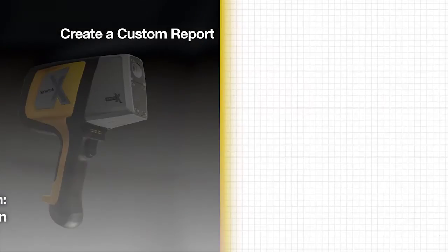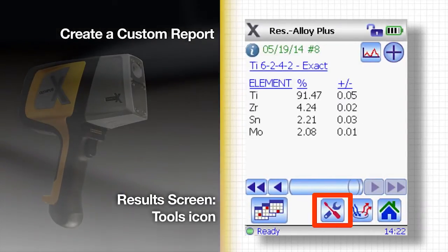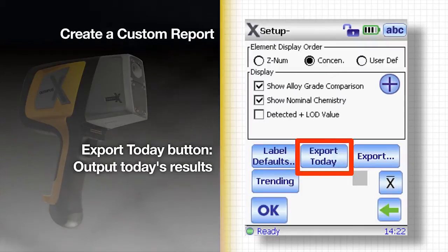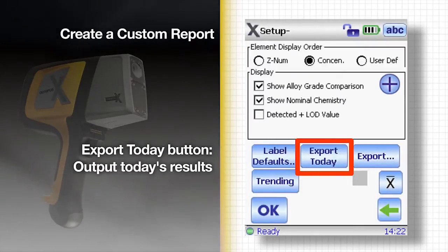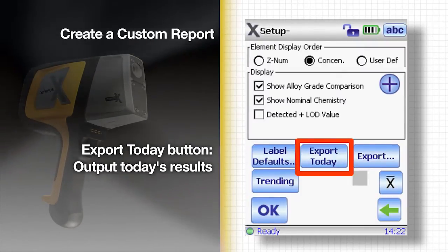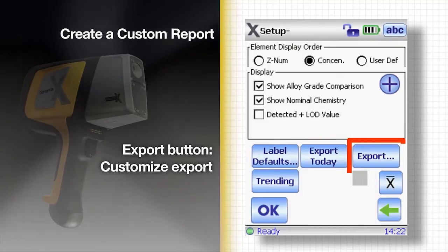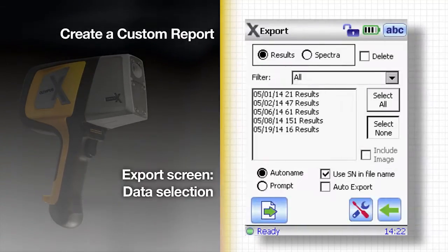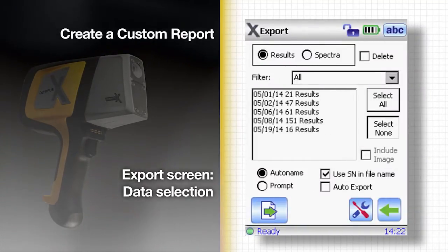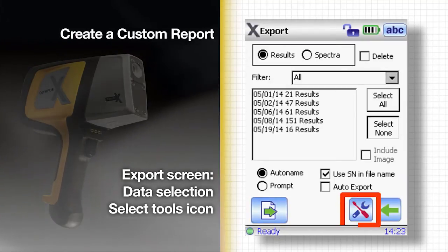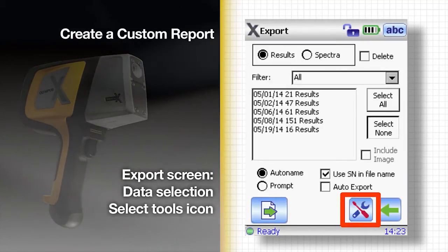On the results screen, tap the tool icon at the bottom of the screen. The export today button is a convenient shortcut to output today's test results. Tap the export button to customize. Here is where you can select what data you want to export. Select the tools icon again.